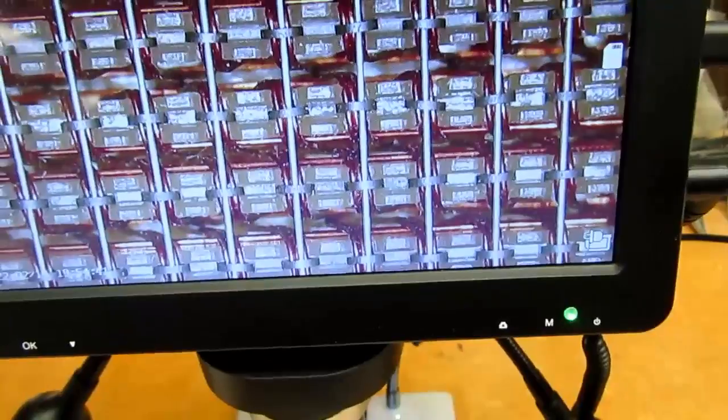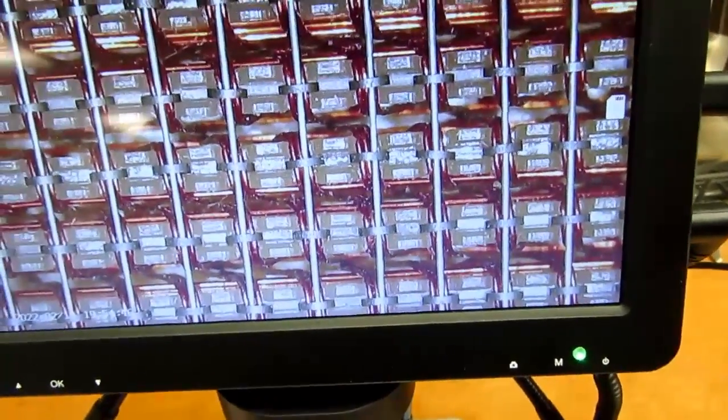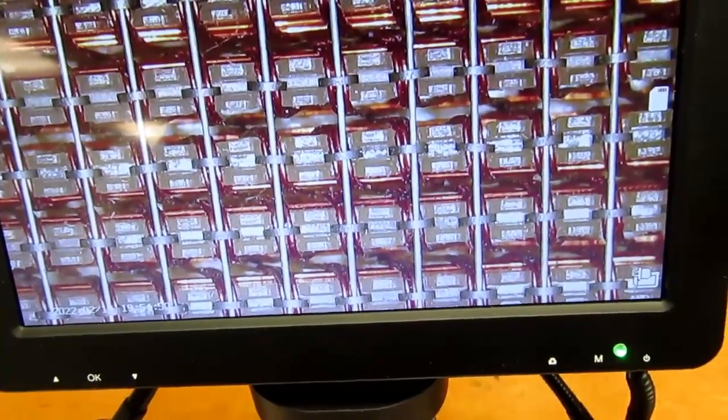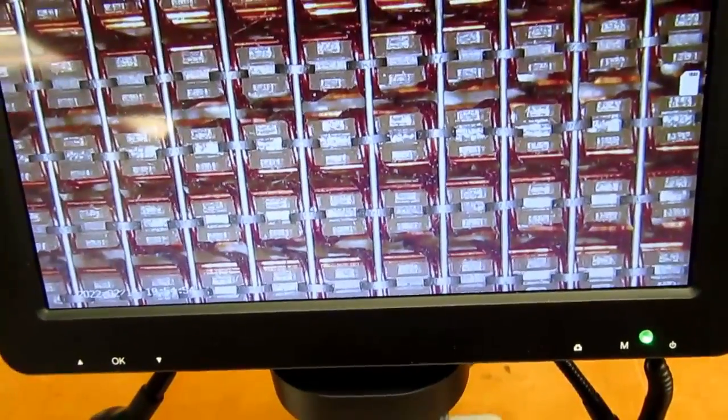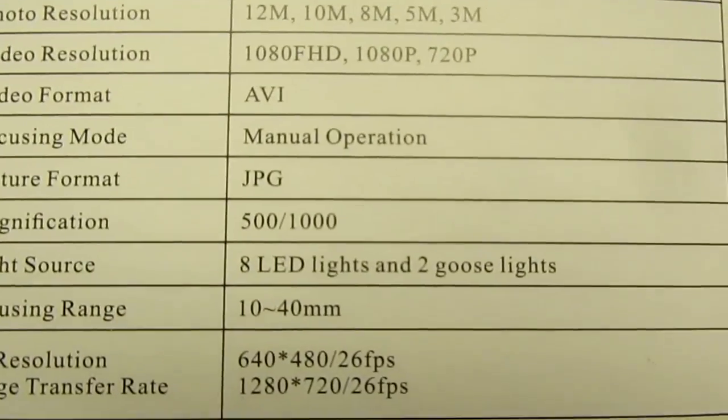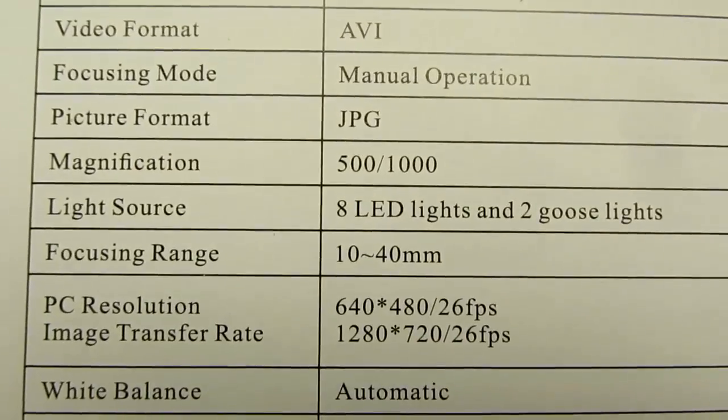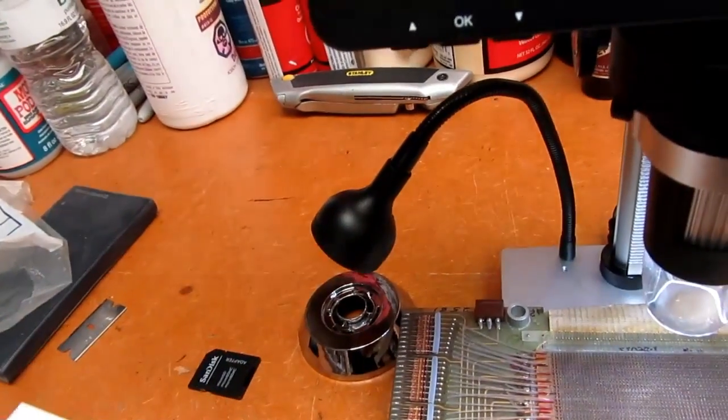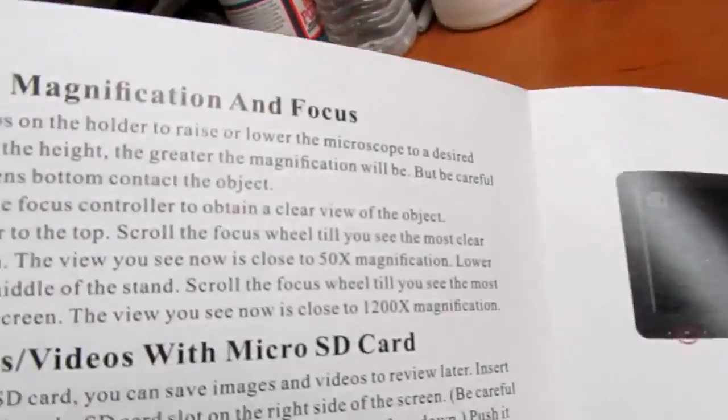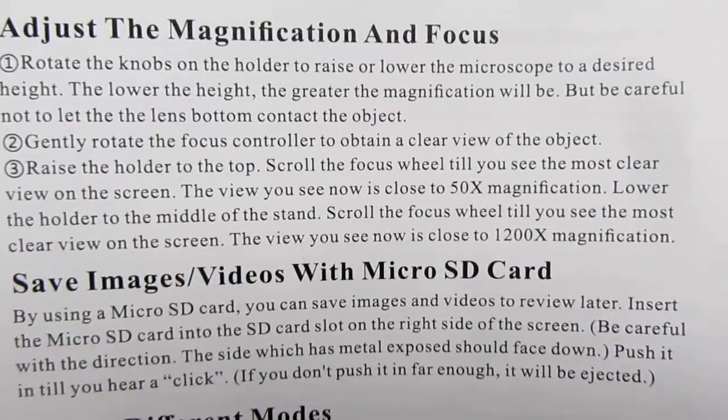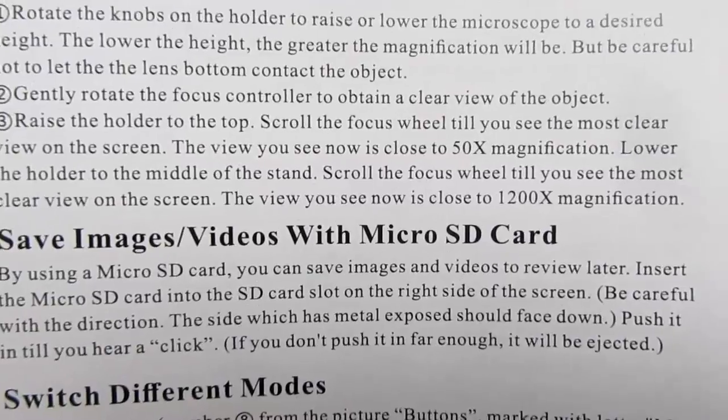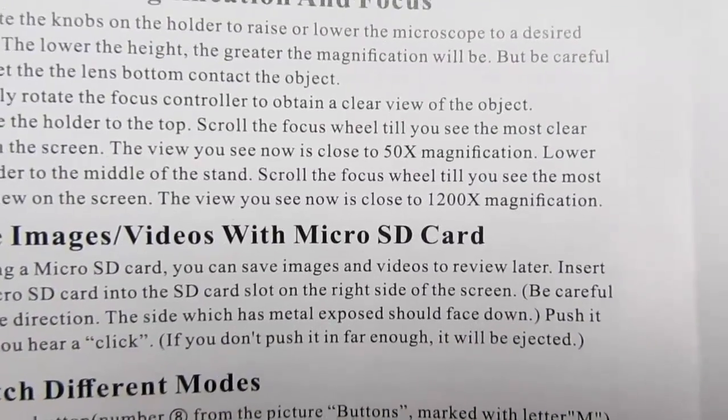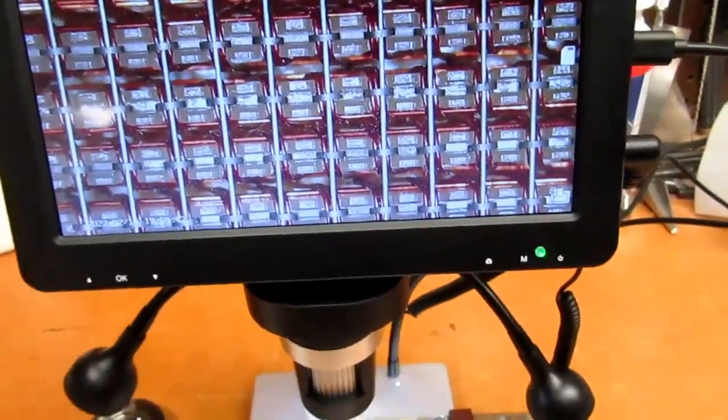Now the specifications for this say that the magnification ranges from, I think it's 50 times. Well, see this is kind of bogus here. Here it says 500 slash 1000, whatever that's supposed to mean. But elsewhere it says that it's I think 50 to 1200 magnification. So what's the truth? Yeah, here it says with it raised up you should get about a 50x magnification. Lowered all the way down you should get something close to 1200. So something's lying. Anyway, I'm getting a pretty clear image here.